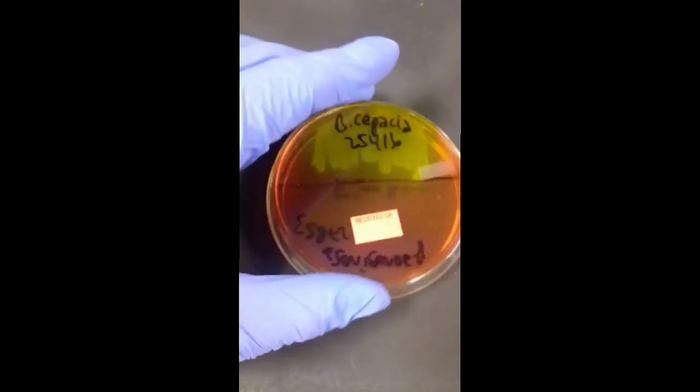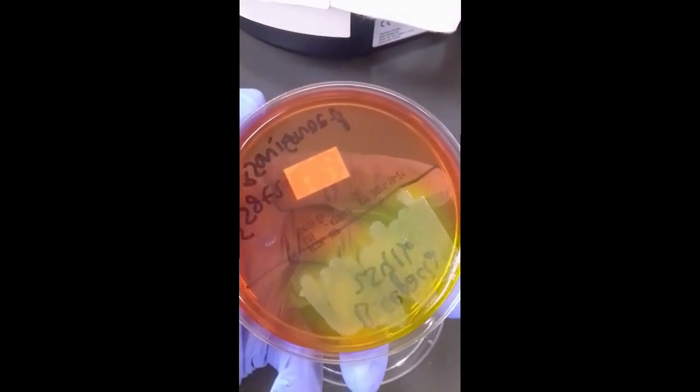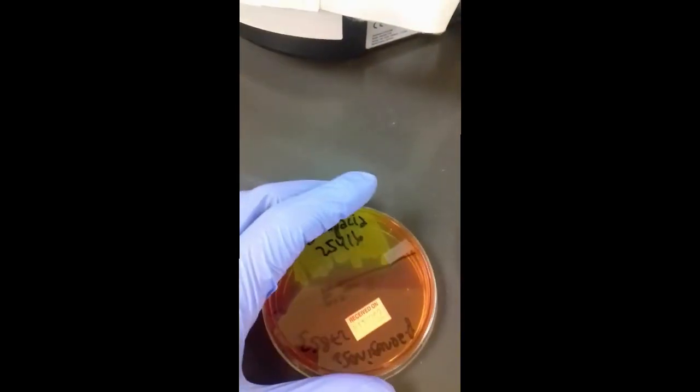And so the basic principle behind media QC is going to be, when you receive the media, you're going to inoculate it with those bugs that it says it should either grow or inhibit. And then you read it after a day or the intended incubation time, and you see if those bugs respectively are growing or inhibited. So I'll show some pictures or a video of that.